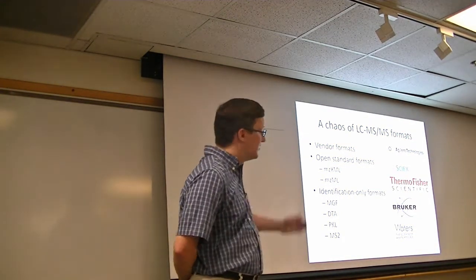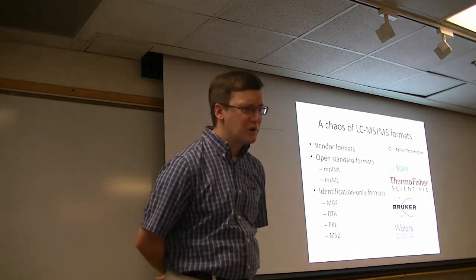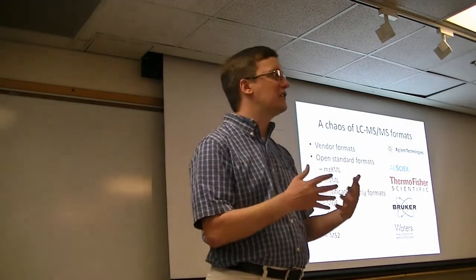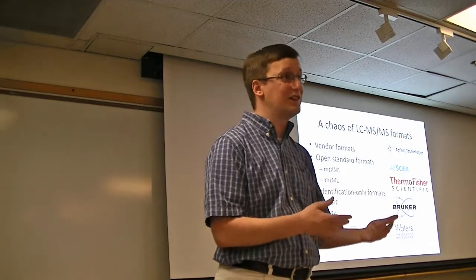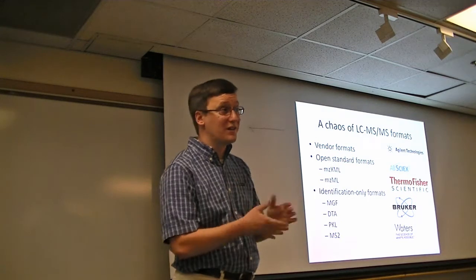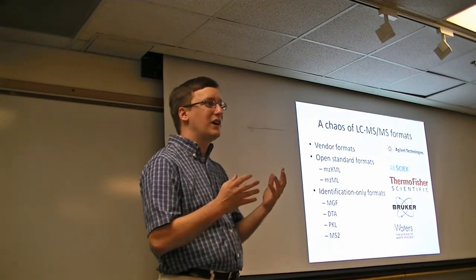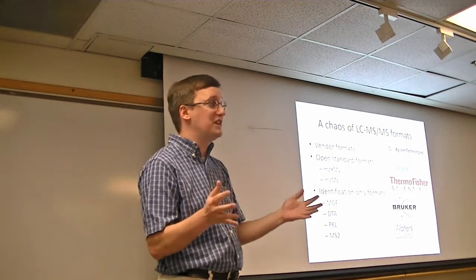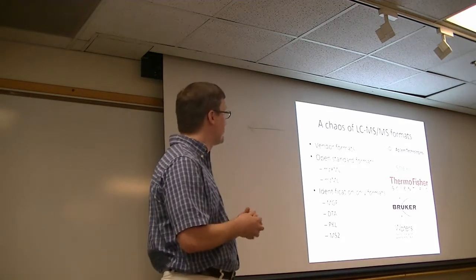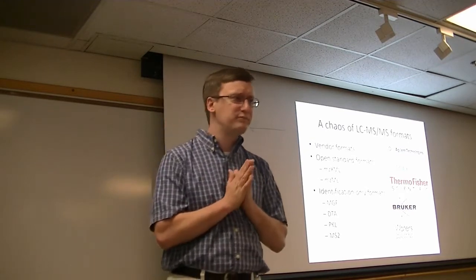So the problem that we run into is the need for a Rosetta Stone. The Rosetta Stone is an important archaeological artifact that helped us for the first time to understand how various ancient languages could be translated into each other. And in the same way, which is why the language company's name is Rosetta. So we wanted to be able to relate across different file formats that are commonplace in proteomics, across many different manufacturers' file types, and also be able to deal with all of the different file formats that have sprung up out of the weeds in the meanwhile.